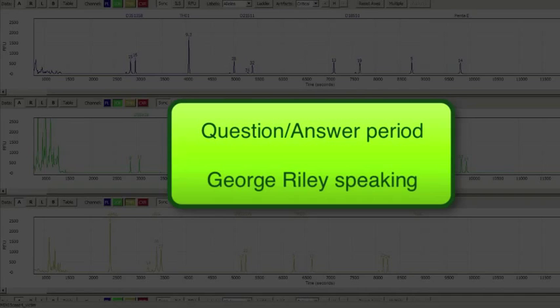Next question is, how do you estimate the threshold value? Every laboratory estimates their own. The forensic laboratories are typically nowadays beginning to do this by looking at the noise levels within the channels for their particular system. And every laboratory is going to have differences because of the different machinery and just the way it's set up. Laboratories have used everything from 150 RFU for FSA files all the way down to below 50 RFU. If you're using HID files, because they have a much higher signal level, they also have a much higher noise level, and you'd have to choose a higher threshold value. To some extent, if you don't want to do noise calculations, you can actually just do this empirically. Just try it out.